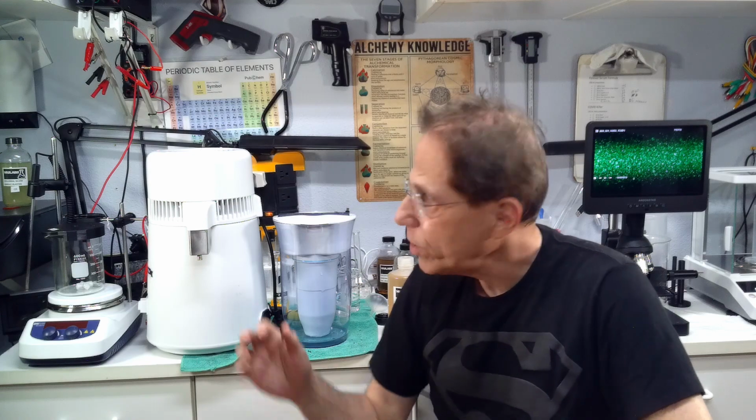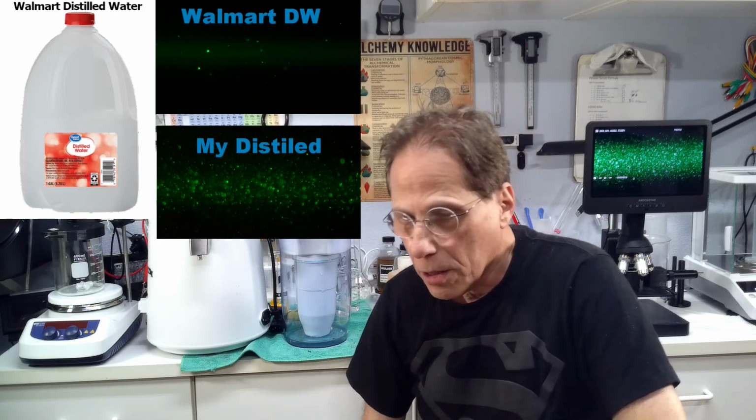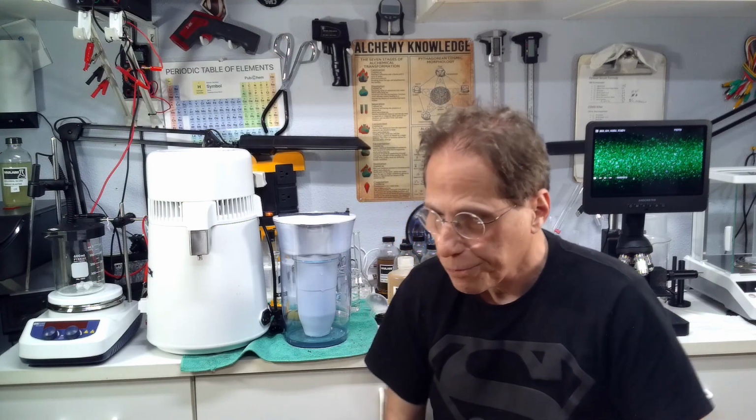You could also buy distilled water. The best quality distilled water is this water I buy at Walmart. I've compared Publix distilled water with Walmart distilled water, and Walmart's distilled water is still a little better in quality, with less of the VOCs or things floating in the water over Publix distilled water.